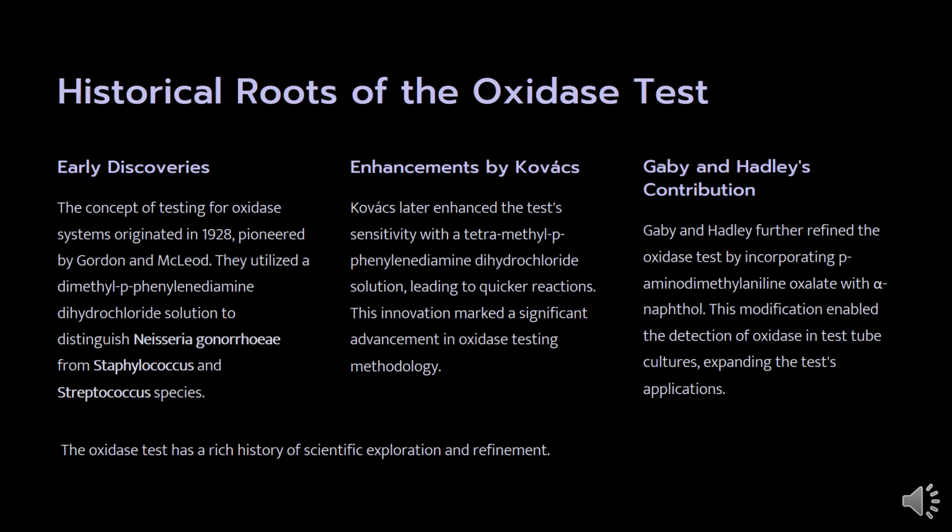Gaby and Hadley's contribution. Gaby and Hadley further refined this oxidase test by incorporating p-amino dimethylaniline oxalate and alpha naphthol. This modification enabled the detection of oxidase in tube cultures, expanding the test's application.